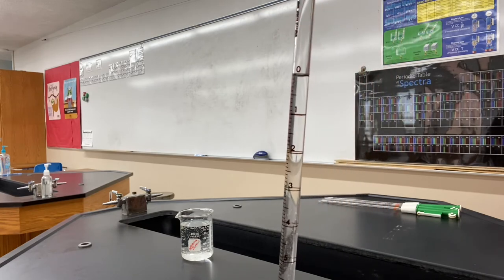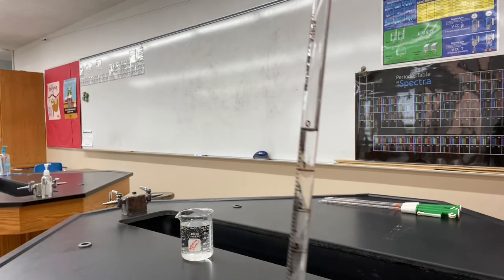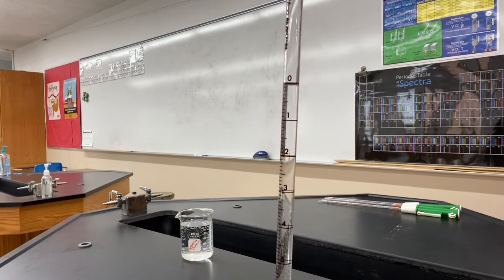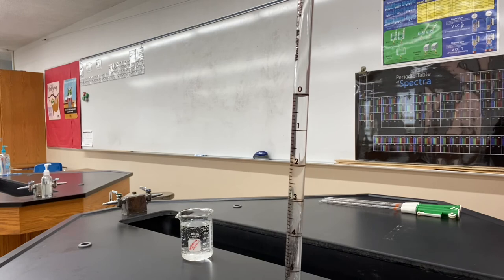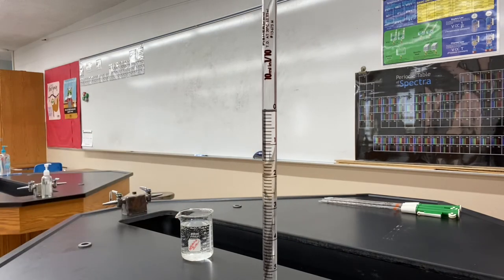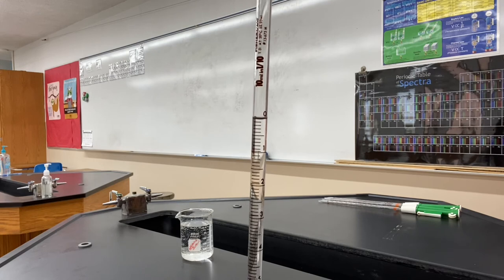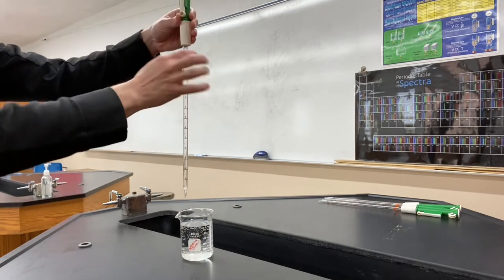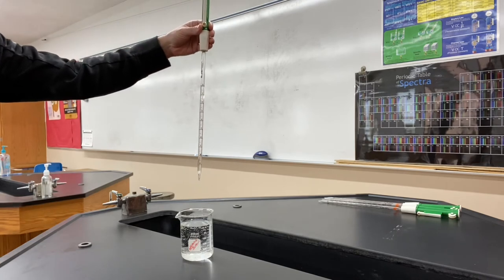It's maybe here. There's a little bit of a curve. And I've noticed again, I might have lost a little bit of fluid. I think it dripped out. That's okay, you just keep working. You're trying to get the bottom of the curve right to the 0 mark on the pipette. Now to deliver the solution, I think maybe this isn't in here tight enough because I'm losing some drops.